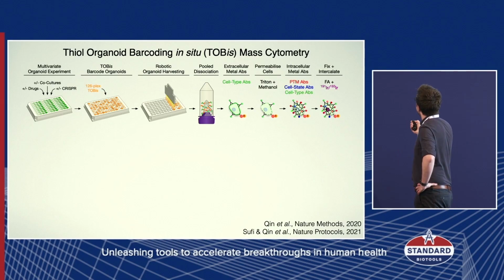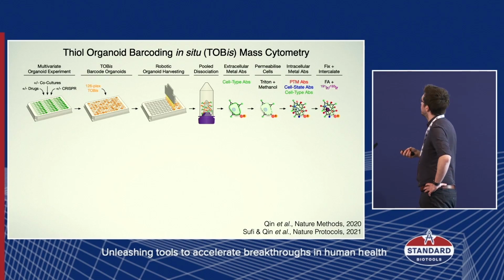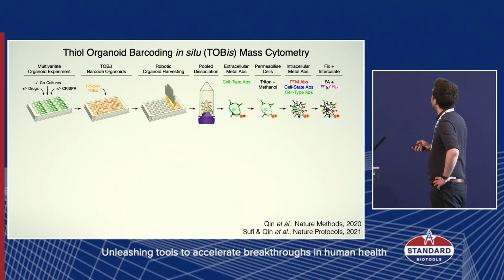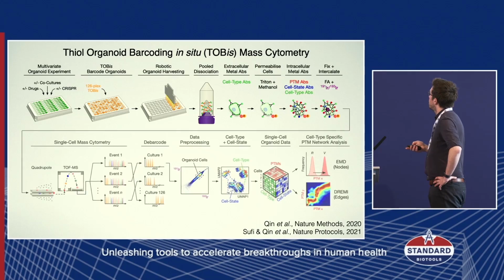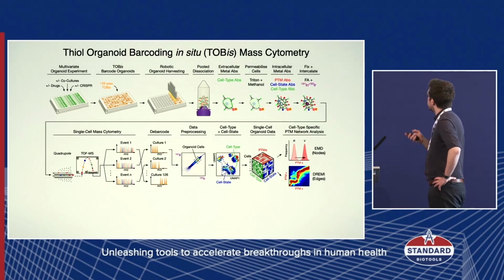We then do extracellular and intracellular antibodies. We have a very large intracellular panel because we're largely interested in signaling, and a lot of phenotypes developed, especially in solid tumor biology, are really at the signaling level. So we have probably about 80% of our panel is intracellular. And then we go for the CyTOF, you all know this, single cell events, debarcode, and data analysis.